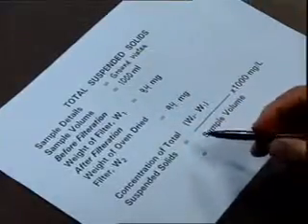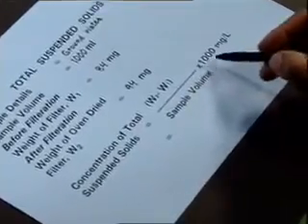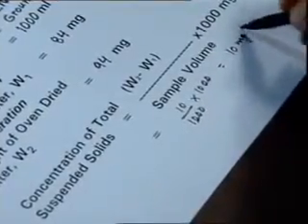The concentration of total suspended solids is found by using the formula (W2 minus W1) divided by sample volume, into 1000, which in this case is found to be equal to 10 mg per liter. For highly turbid waters, the sample should be diluted in order to avoid clogging of the filter. In such case, however, the value of suspended impurities obtained should be multiplied by the dilution factor to obtain the concentration.